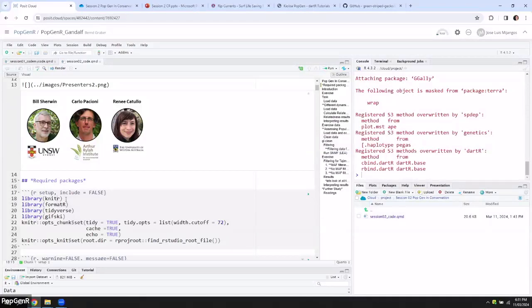And then what I usually do is, once I've worked out what individuals I don't want, when I re-import the data, I eliminate those individuals from the very beginning and then reapply all my filtering, so that you're not knocking off loci that might be on the borderline. If you get rid of the individuals with poor data to start with, then you improve your calls.